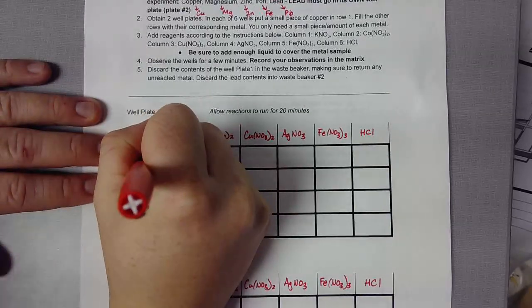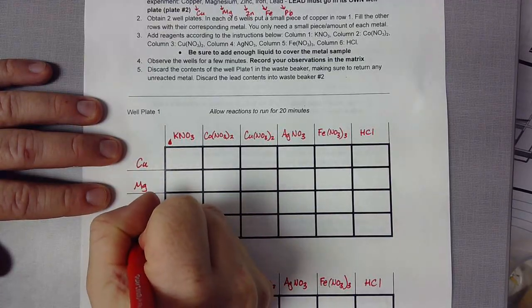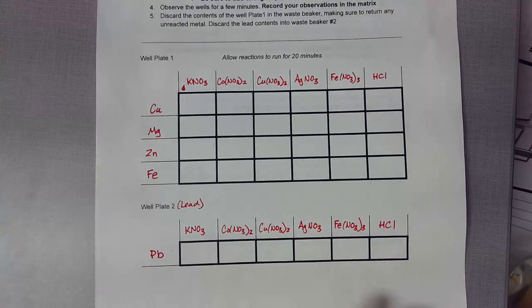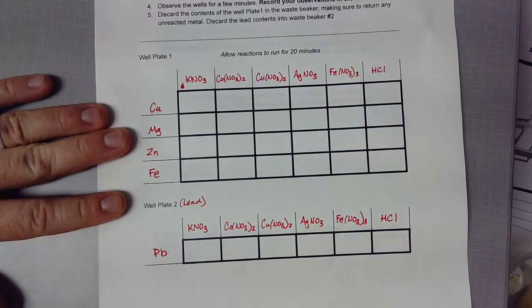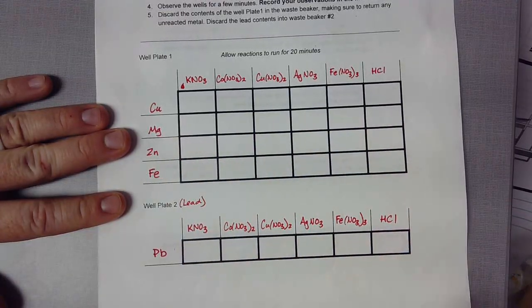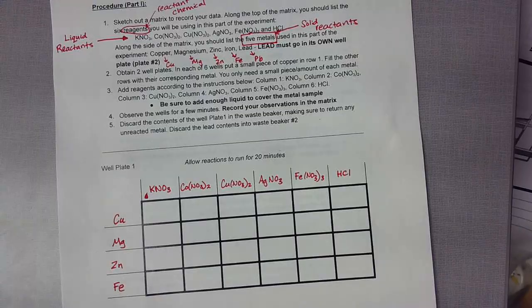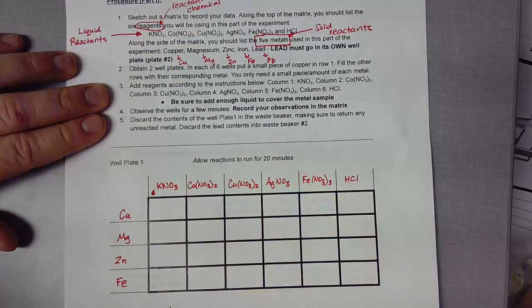So copper is going to go across row 1, magnesium row 2, zinc row 3, iron row 4, and then lead is going to go down in its own plate. So what this means when you do this lab, you're going to drop a piece of copper in each of these wells. Piece of magnesium, piece of zinc, piece of iron, and then you're going to add enough liquid to cover the metal. And then you're going to watch. So I've explained steps 1, 2, and 3 there.